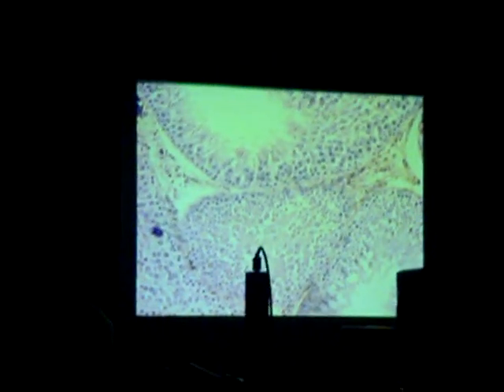On this black slide with that yellow border on there — what is this? This is the spermatogenesis slide.